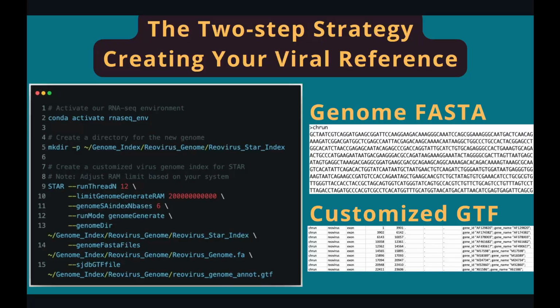Once we have these two input files, we can call STAR to make the index. So here I use the max RAM. I have a computer with 200 gigabytes RAM, so just adjust it to align with your system. This parameter is important for creating the genome index. For human and mouse, use a large number, basically 14. For a smaller virus genome, 6 is enough.